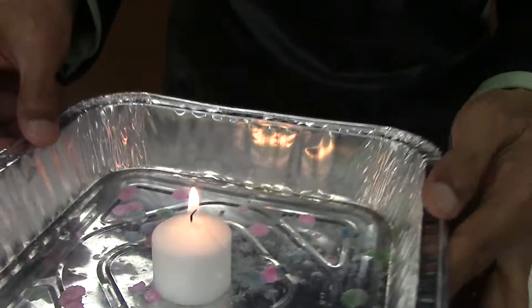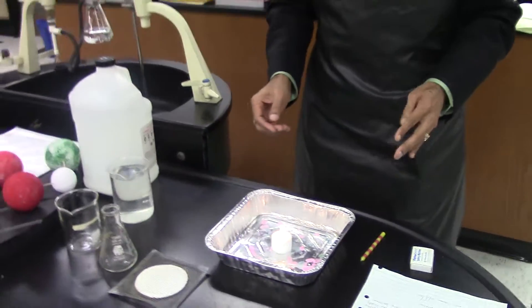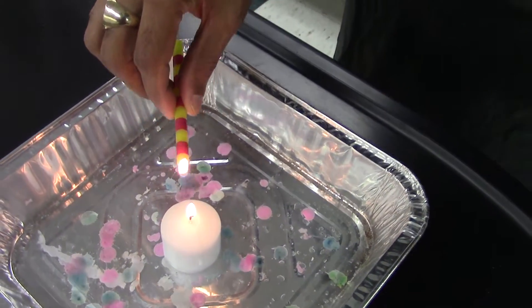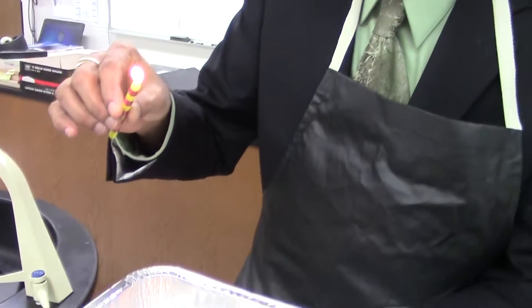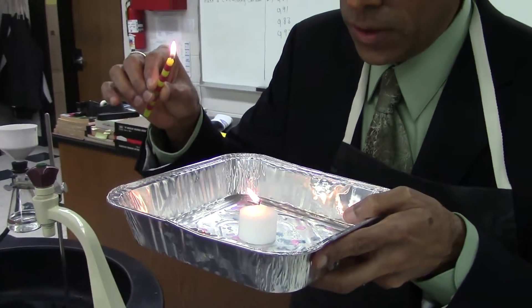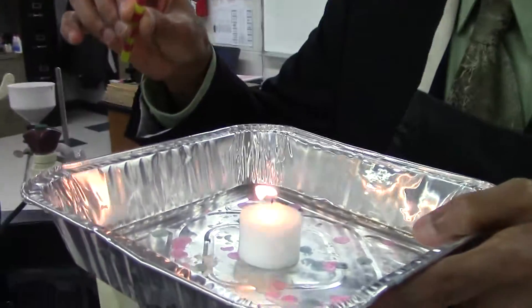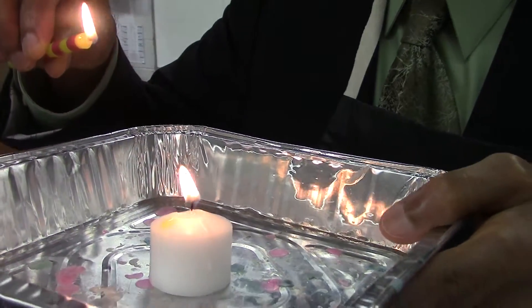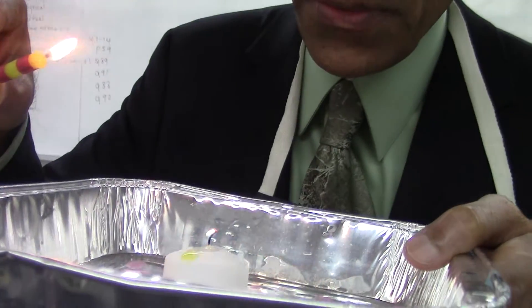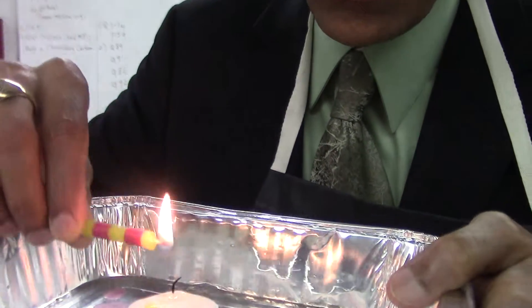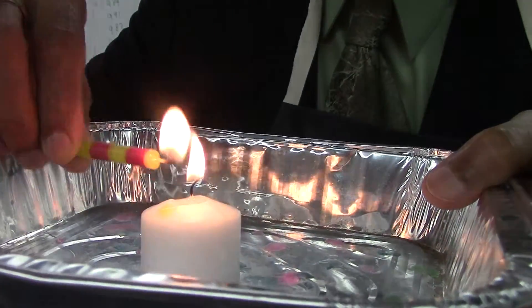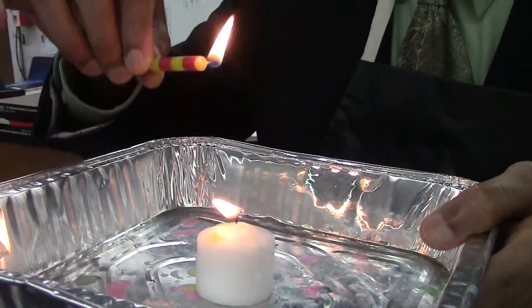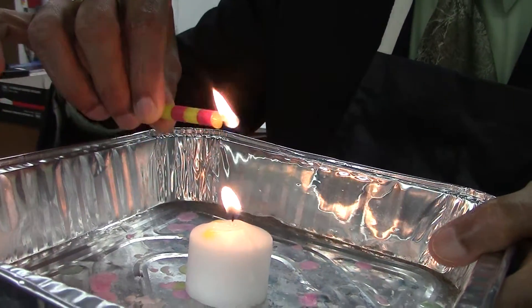I'm going to move ahead and do another portion of the experiment. If I were to light the second candle — I have a birthday candle here — and I were to blow one of them out, I need to get into the white vapor that comes out after you blow out the candle. If I were to get into the white vapor itself, you will see that the vapor actually catches fire. It burns very quickly. It catches fire because it's the vapor that actually catches fire. It's not the liquid wax, it's not the solid wax, but it's actually the candle vapor that actually burns.